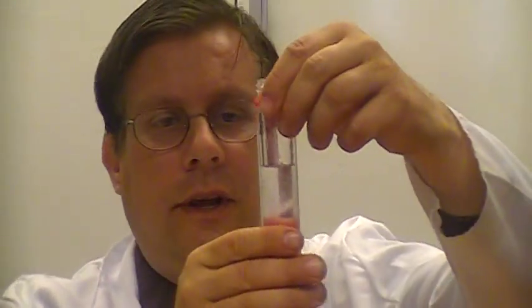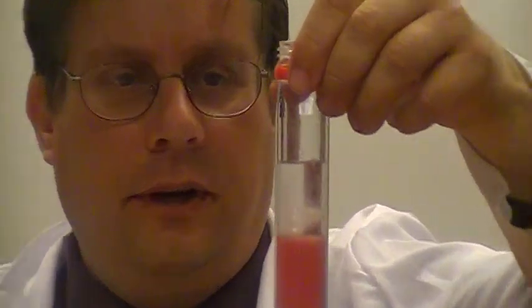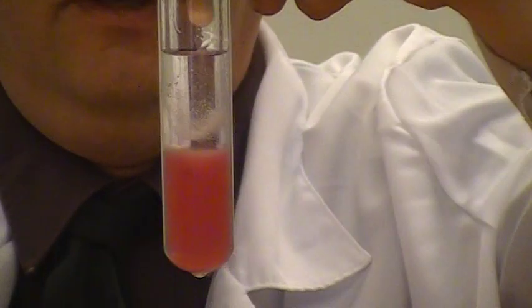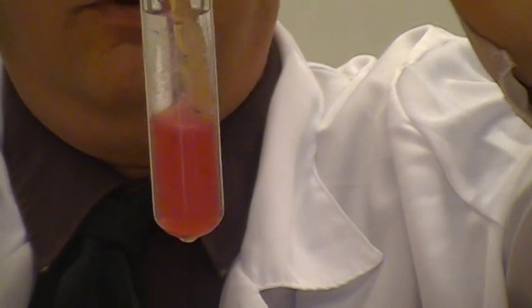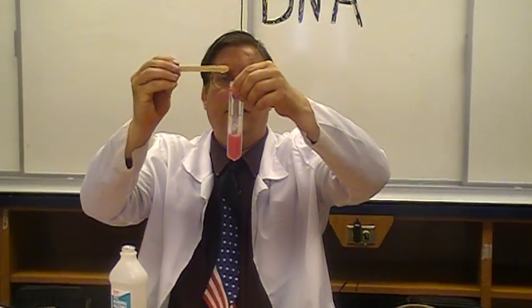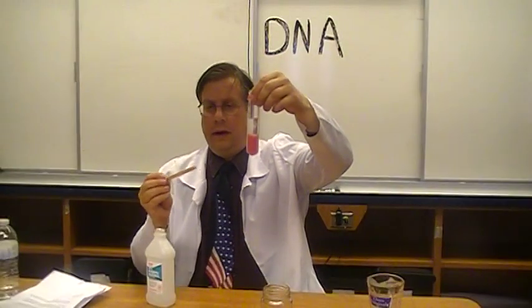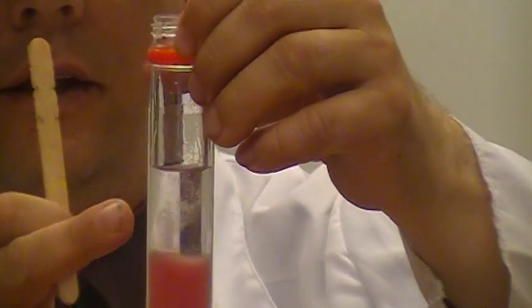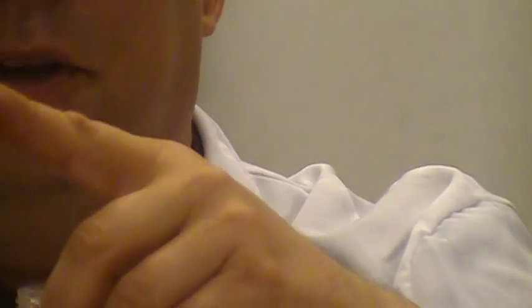So, once again I can see a big gauze-like structure forming here. I'm going to stick the stick in. I'm going to try to twirl it around and pick up some of this gauze-like structure. And I don't think you can see it on the camera, but I've been able to scoop a little bit on the popsicle stick. And so, like I promised, you can not only see the DNA, if you like, you can actually touch it. So that's it. Thank you.